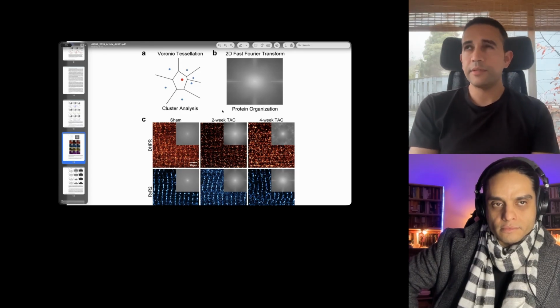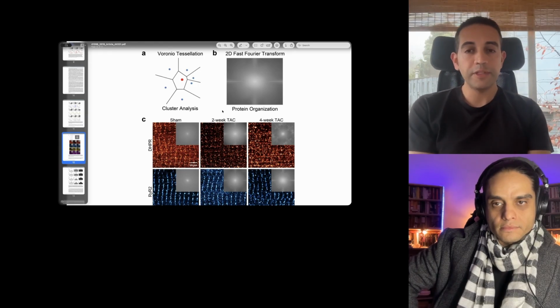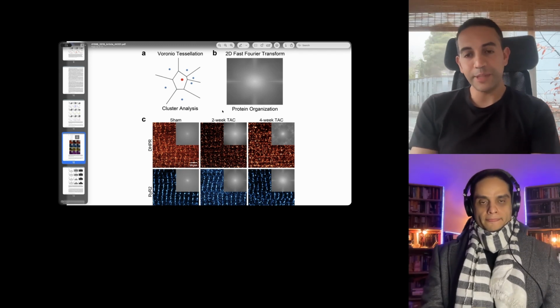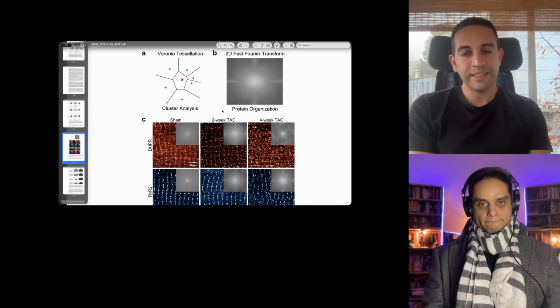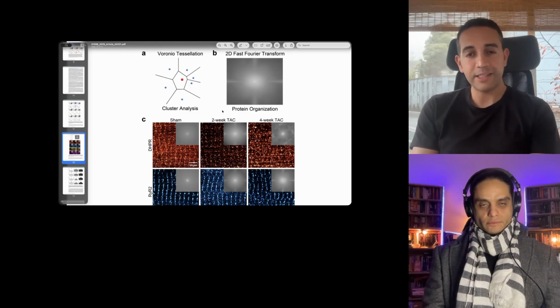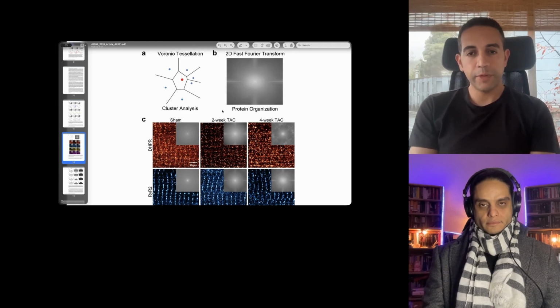And I remember, now that you're asking me, some of the decisions we made in regards to which protein to go for were tightly related to the availability of antibody. So it's not as if we decided we're going to pick these 4 guys and we're going to stick to them, we're going to make it work at any cost. It's which ones would realistically allow us to probe it, knowing that we have high, or as high as you can get, specificity of labeling.